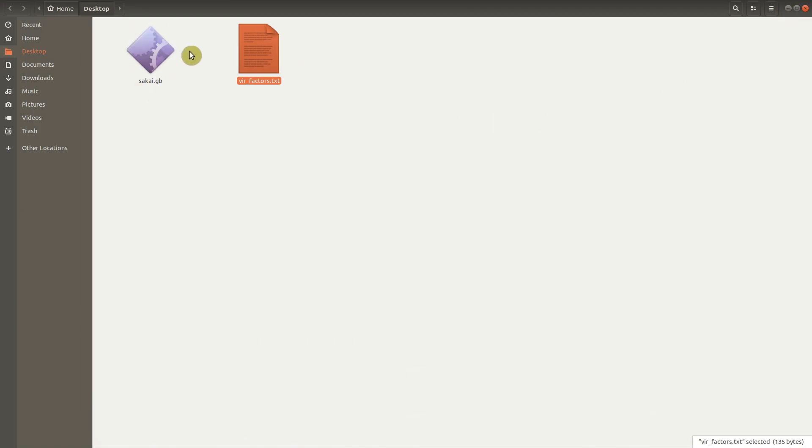This is the file that has been downloaded. So let's quickly go to the Python terminal and continue the rest of the task.